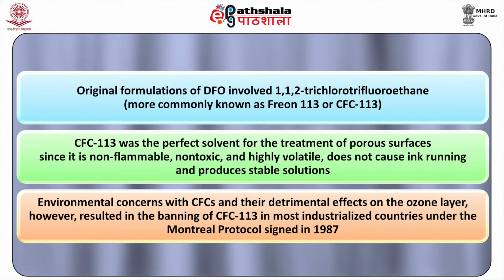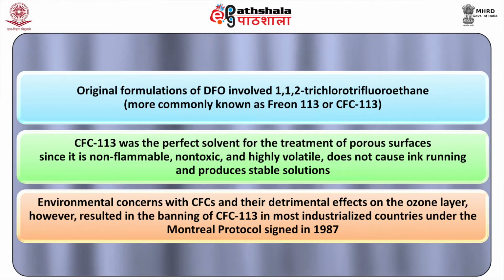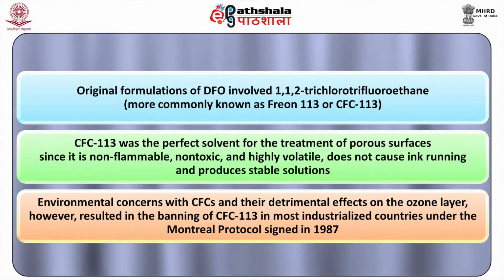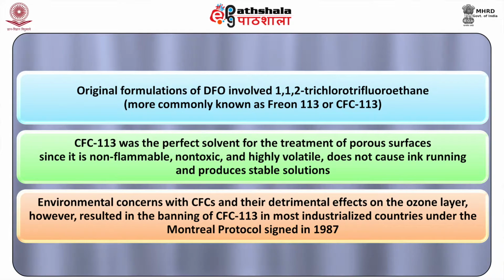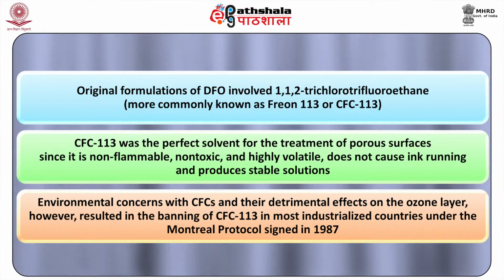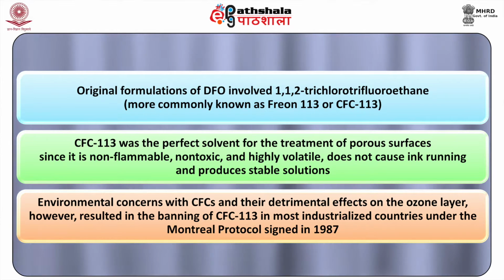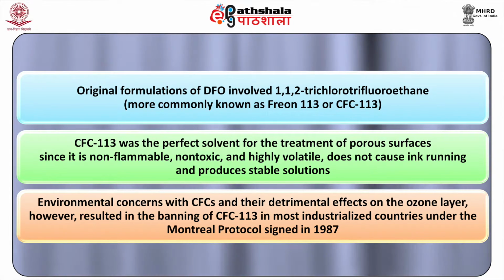The original formulation of DFO involved 1,1,2-trichlorotrifluoroethane, more commonly known as Freon 113 or CFC 113. CFC 113 was the perfect solvent for the treatment of porous surfaces since it is non-flammable, non-toxic, and highly volatile, does not cause ink running, and produces stable solutions. Environmental concerns with CFCs and their detrimental effects on the ozone layer, however, resulted in the banning of CFC 113 in most industrialized countries under the Montreal Protocol signed in 1987.